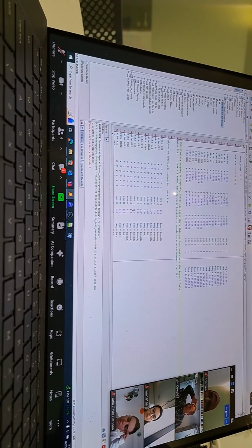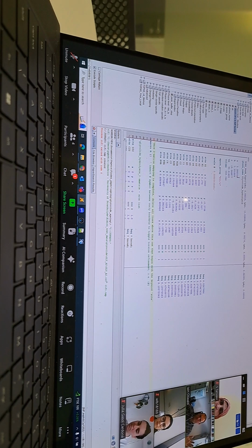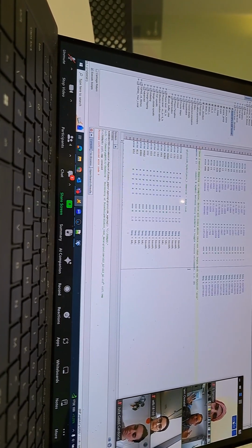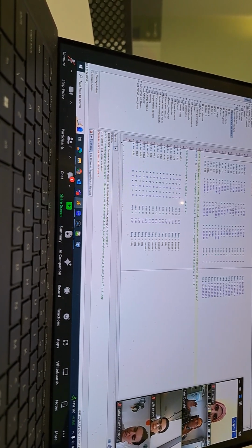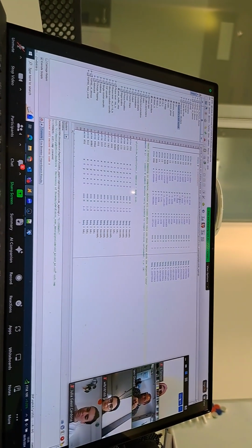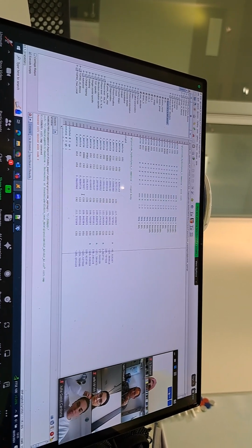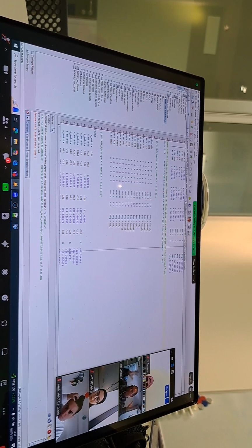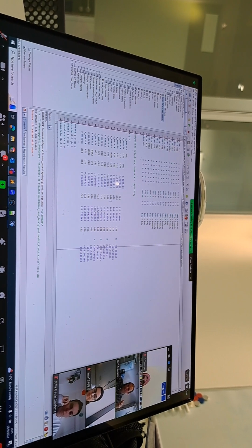Okay, so what you're saying there then is within my unit cell of 5 by 5 by 19, there are now two crystal structures. One, which is the real one, where all the molecules are sitting, this one up here. But then there's a second one, where all the atoms are at 0, 0, 0. Okay, you can see all atoms at 0, 0, 0. What's instantaneously going to happen is that when we press go, those atoms are going to go from 0, 0, 0 and spring out into a molecule that you've defined here. Yeah?